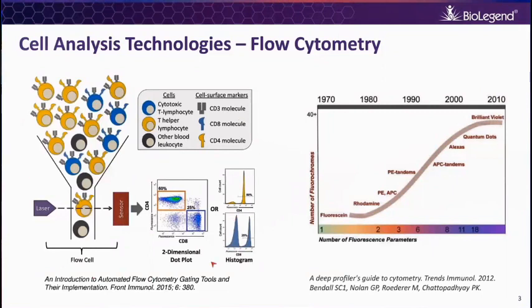Here to the left, we have this diagram showing how different cell types can be detected using flow cytometry. Typically, there is a laser that is going to excite a fluorophore that is conjugated to an antibody typically, and that antibody is going to detect molecules that are expressed by these cells. Then the signal that is collected from that excitation is processed by this instrument, and you can see here just simple examples of expression of CD4 and CD8, for example, in T cells.